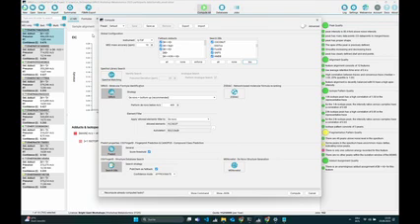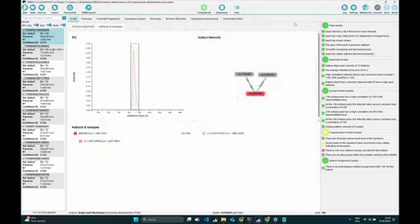The confidence score is basically telling you how sure the software is about the result, and the CSI FingerID score is basically the measurement we need to produce the result. As I briefly mentioned earlier, the CSI FingerID score is really local, it's just comparable within the results of a feature, and it's not comparable on a global scale. So it's a local score basically.